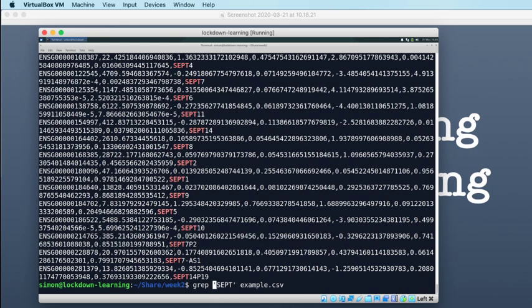Regular expressions we define using a programming language called Perl. And to switch that on, we need to use this -P option for Perl. So this switches on our ability to use a regular expression. And then if we want to match septin followed by numbers, then we need to say, okay, I want to find sept, and then I want a number afterwards.